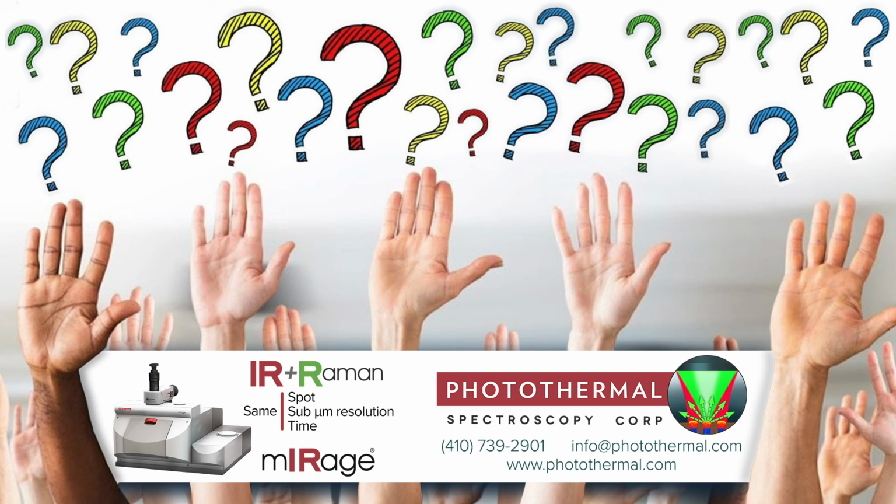This one I'll give to you as well, Christoph. How do you see the value of IR and Raman working together for these sorts of applications? Yeah, of course. Both infrared and Raman spectroscopy are complementary to each other. For example, there are in Raman spectra a lot of signals from aromatic amino acids, which are almost invisible in the infrared spectra, and therefore these two spectra are highly complementary.